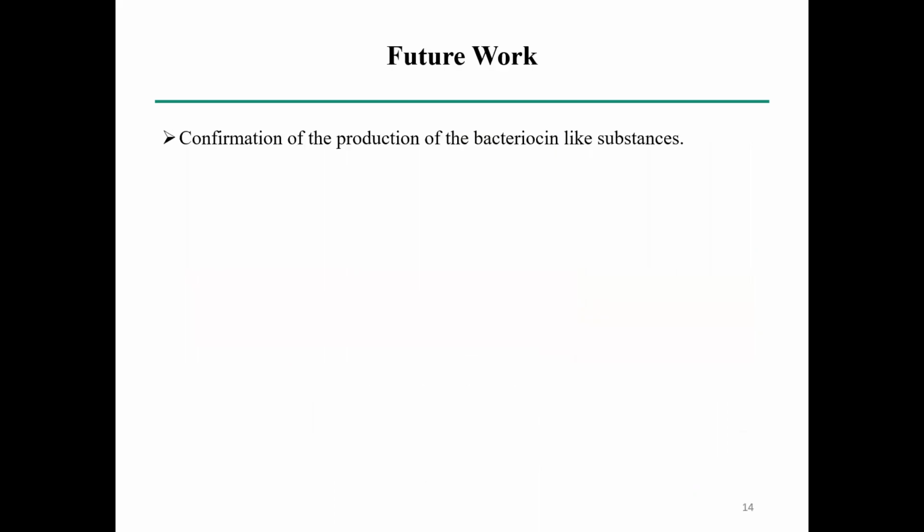The future work is we have to confirm the production of bacteriocin by doing neutralization with NaOH, inhibition of H2O2, and by adding proteinase K enzyme.